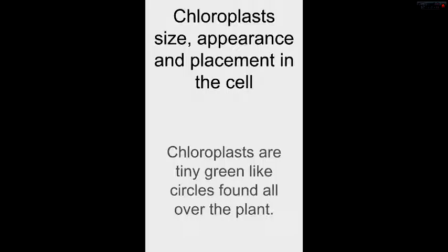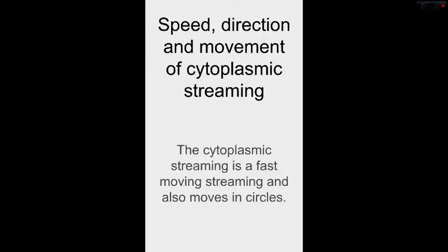The chloroplast size, appearance, and placement in the cell: chloroplasts are tiny green-like circles found all over the plant.